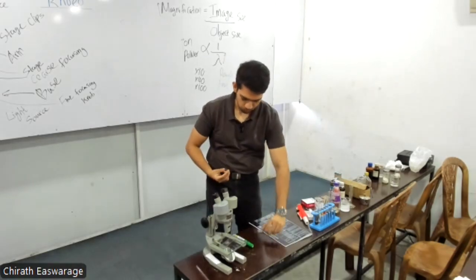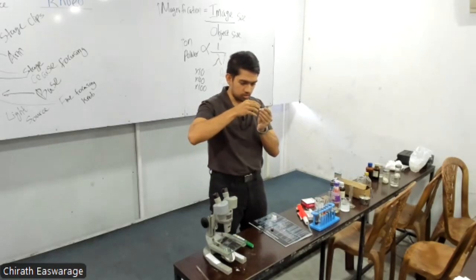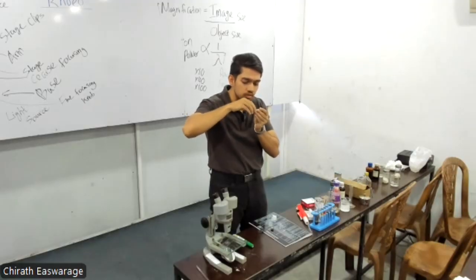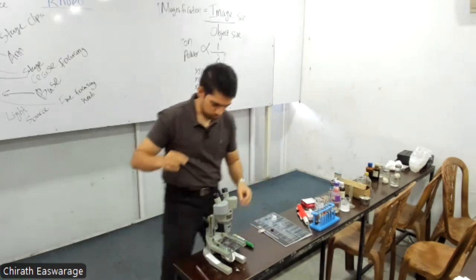But no need for that. Place it nicely on the edge, and slowly put it down, and it's kind of okay. I think it came out okay.